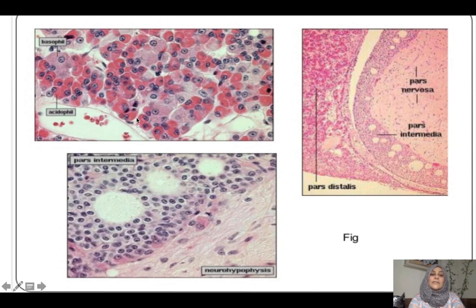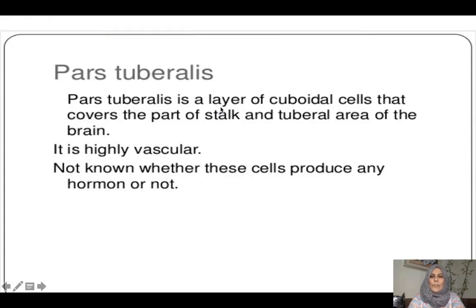هاي احنا كل شيء نحبها مال non-functional، but they found it is present in between these chromophils and chromophobes, and even they form gap junctions between them. أكيد for a functional reason, but till now it is not illustrated within the papers and said within the textbooks. But we should mention its importance and presence. إذا نيجي على العدد اللي موجود الكروموفيلز، هذه الطوخ اللي موجودة، وقلنا الفاتحة هي الكروموفوبس، and in between we can say there is the folliculostellate cells.